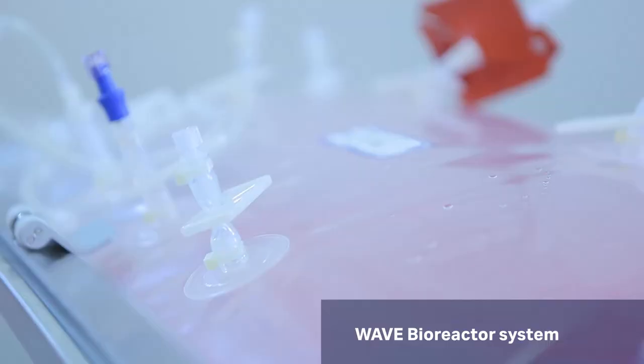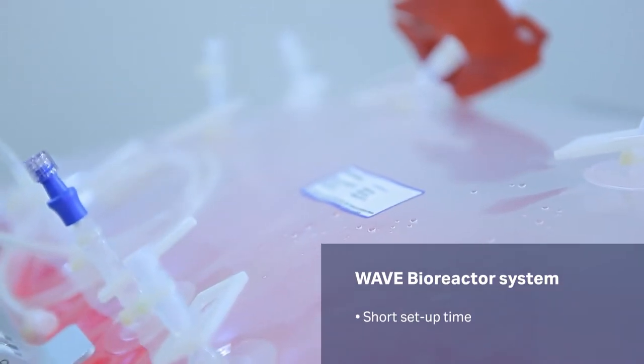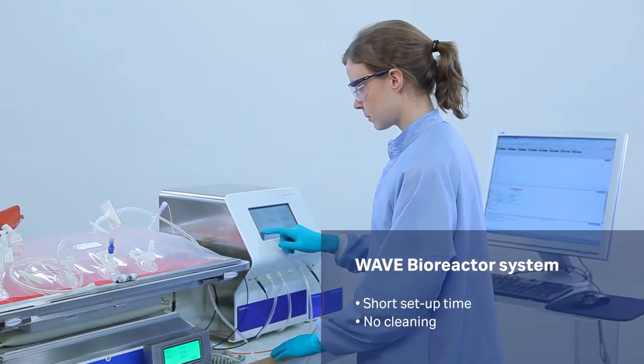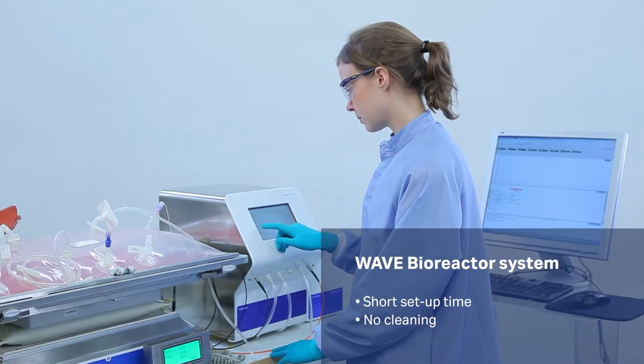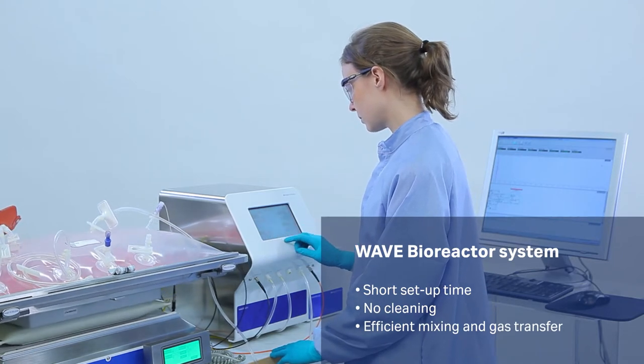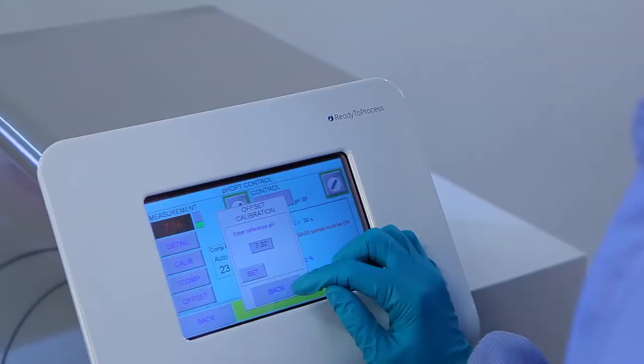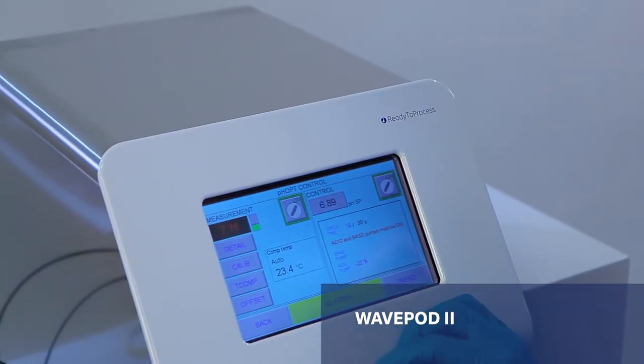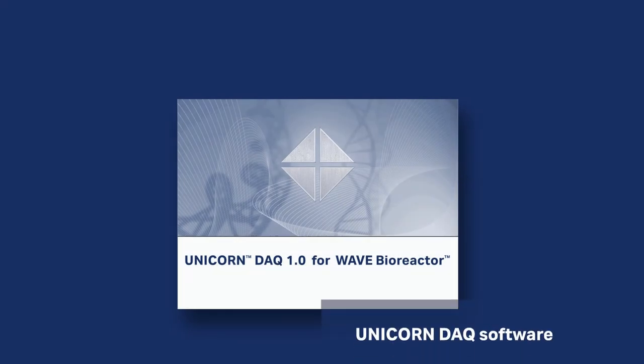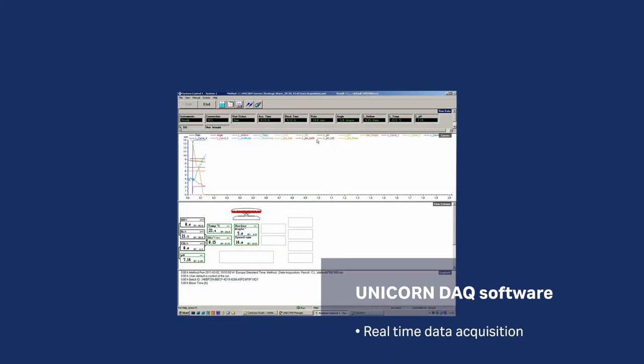The system has very short setup times without the need for cleaning or sterilization. The rocking motion of the platform provides efficient mixing and gas transfer, resulting in an environment well-suited for cell growth. The WavePod 2 controller monitors and controls culture parameters, while Unicorn DAC software enables real-time data acquisition.